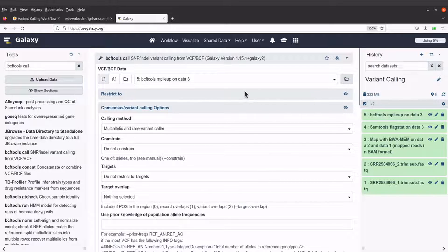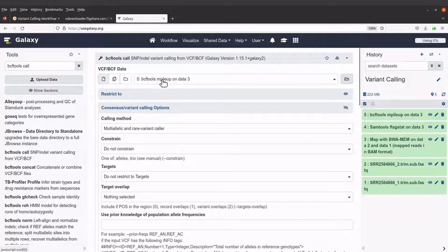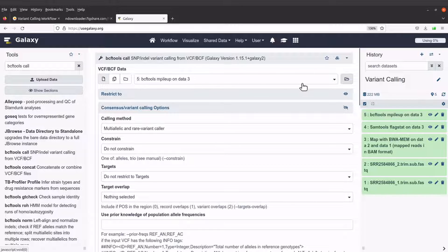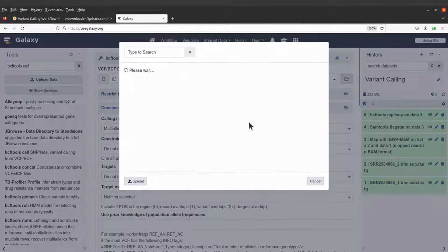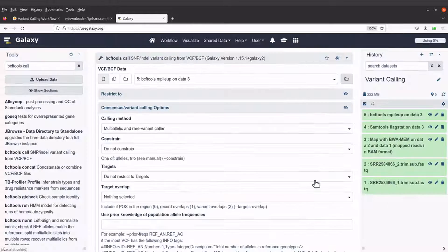Then I will specify my data. I'm using the output from bcftools mpileup. It has already been detected. So we will proceed. If you don't see it, just click and then select the appropriate file.